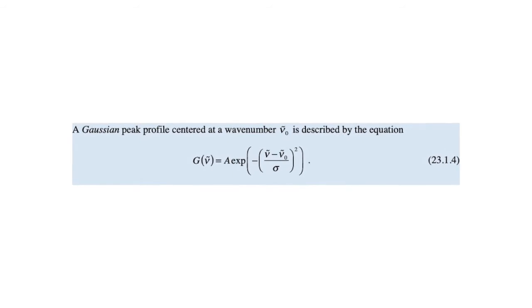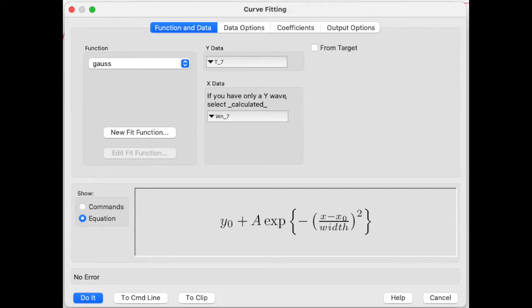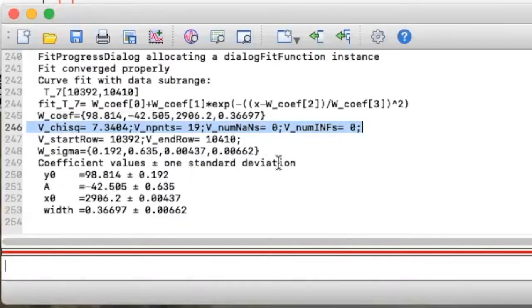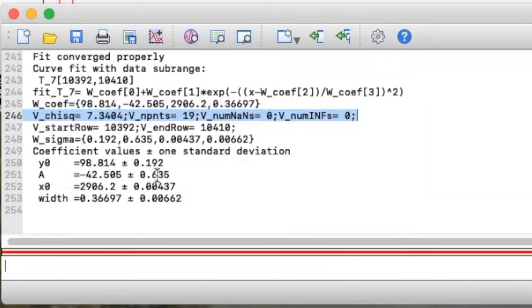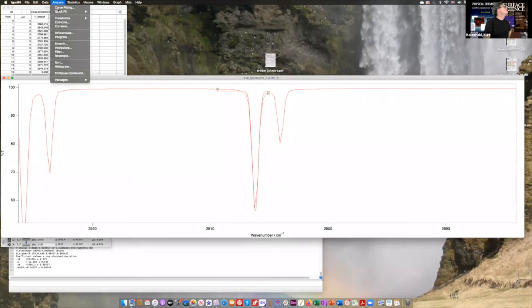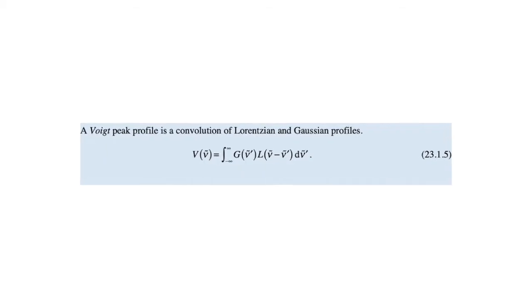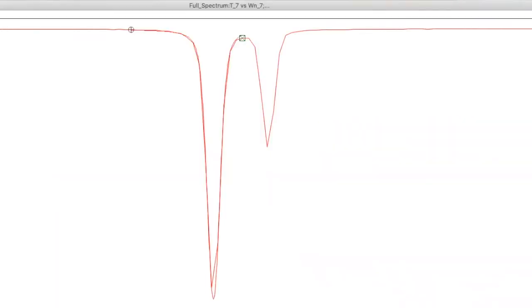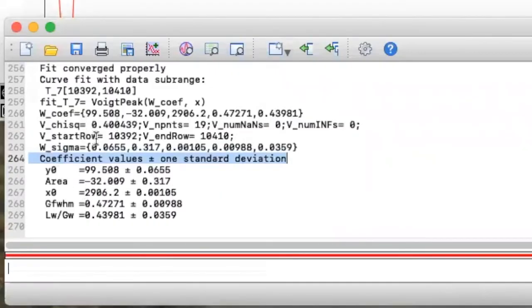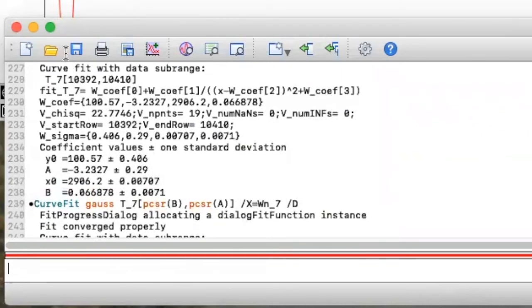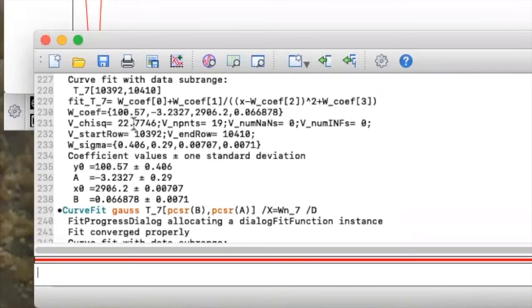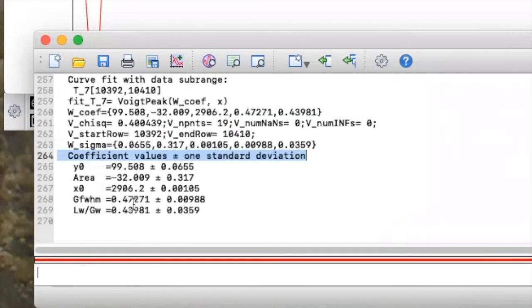We could choose a Gaussian instead — fitting between the same positions. That's looking a little bit better. Both give 2906.2 in both cases. But to really make this look good, there's a mixed Voigt profile — and look at that, that's a beauty. Was it really a better fit? The chi-squared value is 0.4 for the Voigt, compared to 7 for the Gaussian and 22 for the Lorentzian. The Lorentzian wasn't too bad, the Gaussian was better, and the Voigt profile is even better.